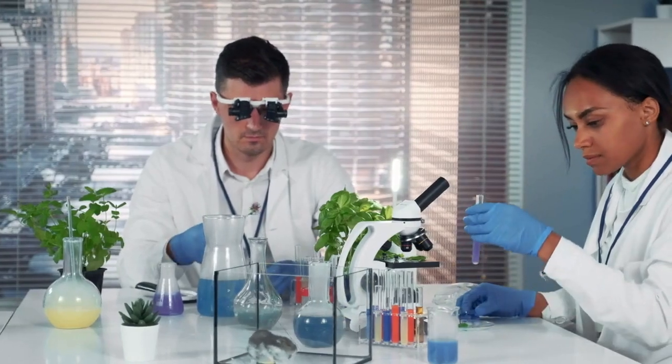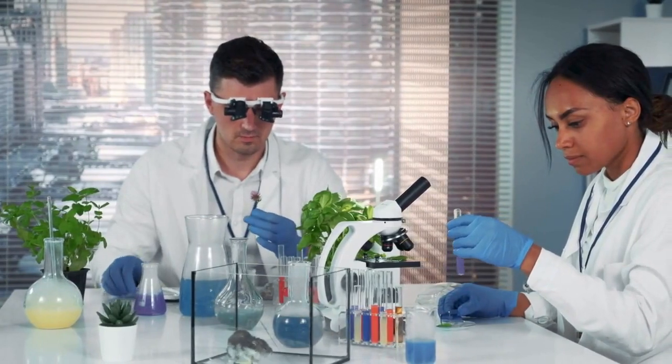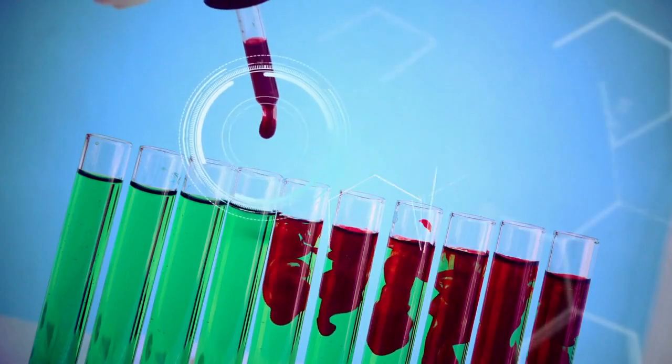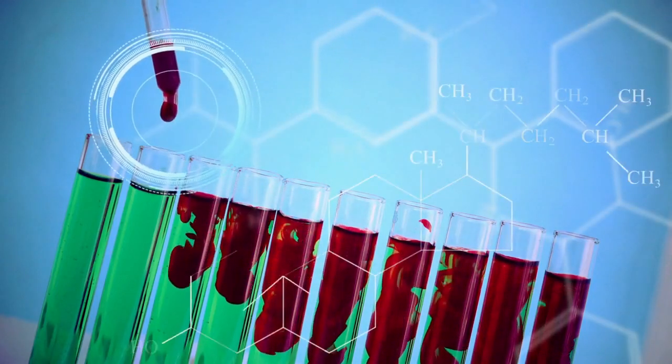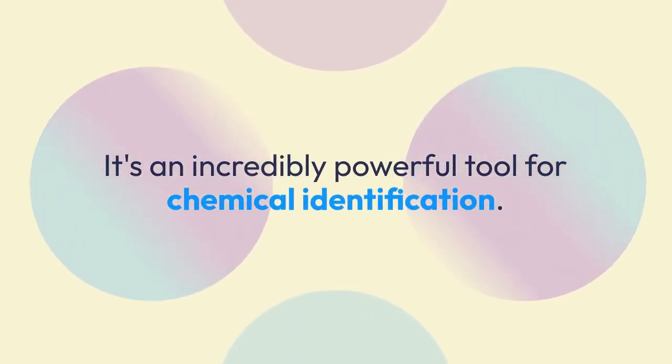Because different types of bonds, like a carbon-hydrogen bond versus a carbon-oxygen double bond, all vibrate at different, predictable frequencies, scientists can look at the peaks on the spectrum and figure out exactly what kinds of bonds are present in an unknown molecule. It's an incredibly powerful tool for chemical identification.